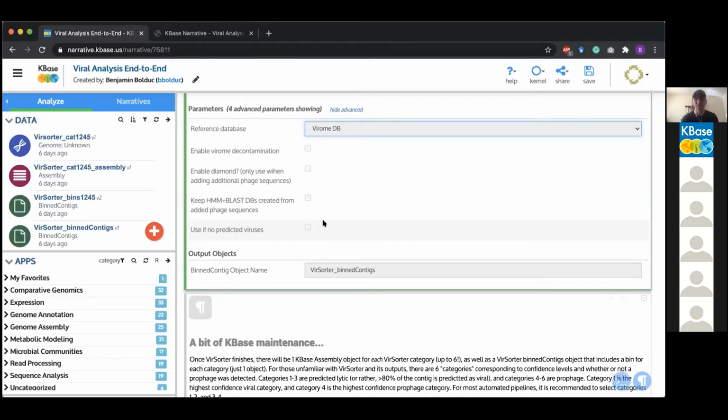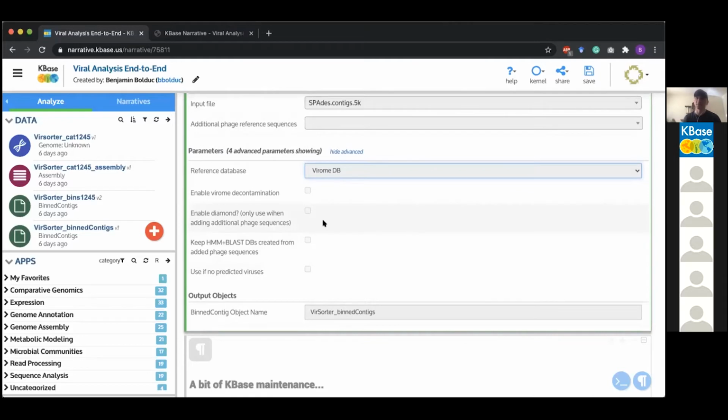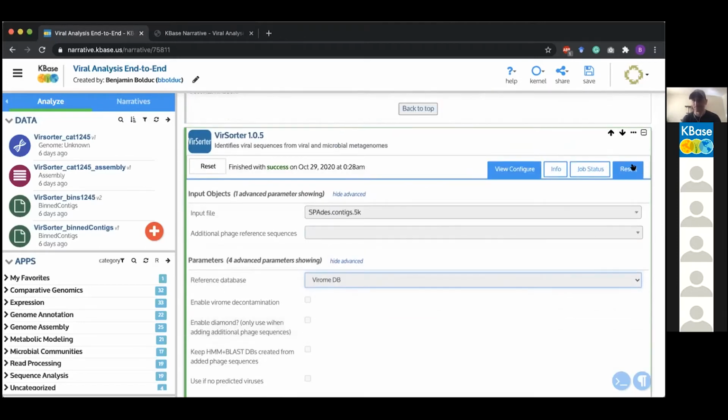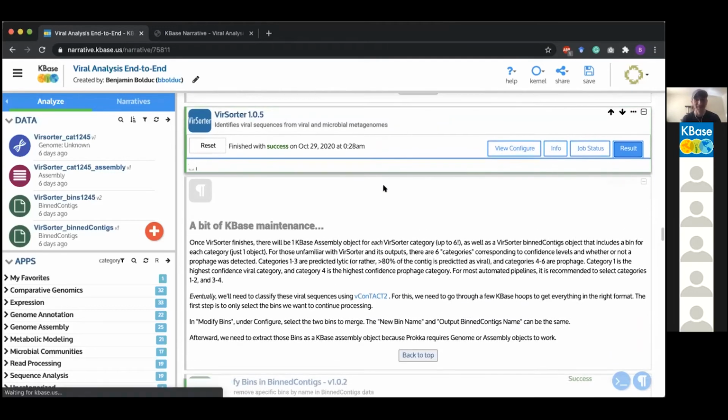You can still use this if you have a lot of viruses in your data set. But the cost benefit, it's not really worth it unless you're really paranoid, for adding this to every single data set. Okay, so let me try to go more quickly through this.